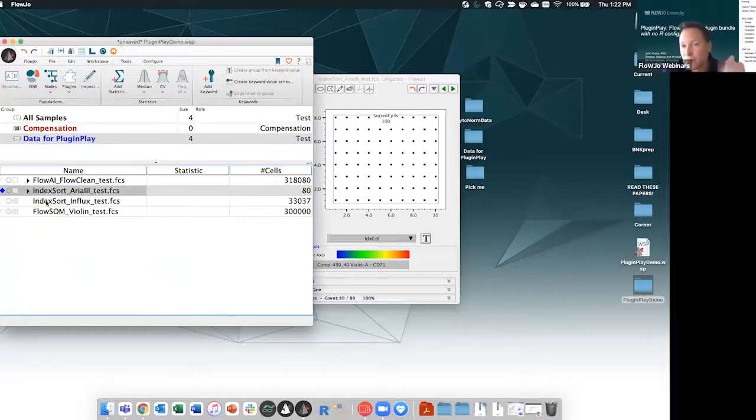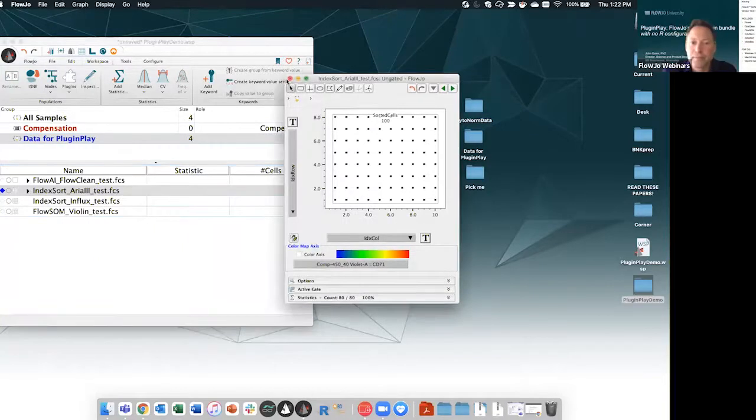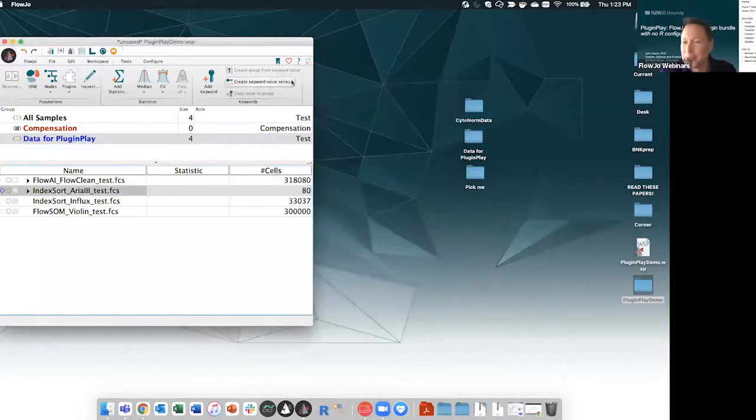So index sort. And sorry, I'm speaking like we're short on time. Having covered the most exciting part of this thing at 8 minutes, we've got plenty of time here. So yell at me if I continue to speak at East Coaster pace. Sorry for all West Coasters here. Sorry also for the subtle dig on West Coasters.